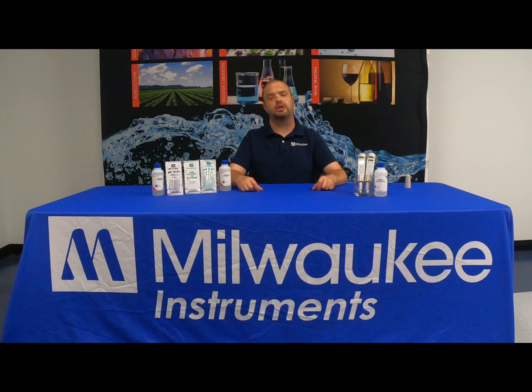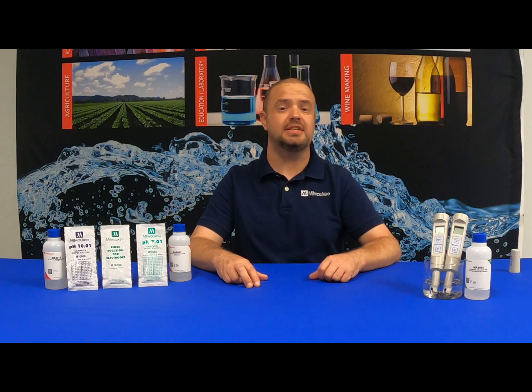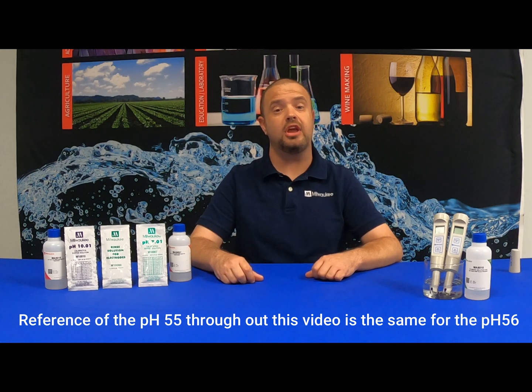On today's video, we will be going over the calibration procedure of the Milwaukee Instruments PH55 and PH56 pocket testers. The only difference between the PH55 versus the PH56 is that the PH55 tests in tenths while the PH56 tests in hundredths. Other than that, they calibrate the exact same and they also have the same replacement electrode.